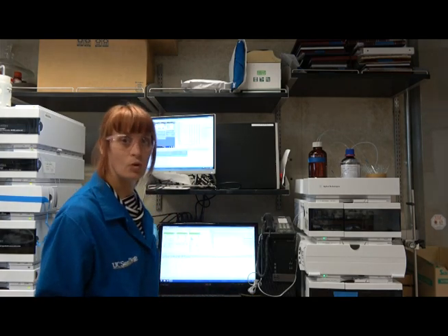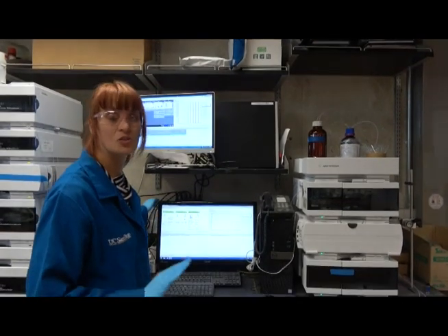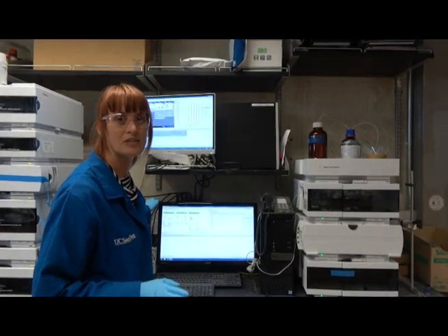The software interface is almost the same, except this one is newer, so there's maybe a couple things that are going to be different.